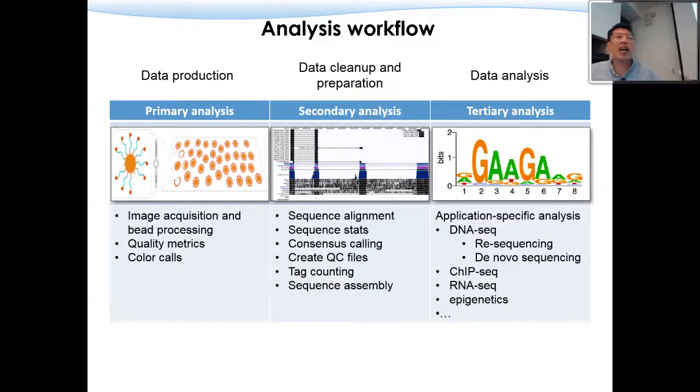Okay. If I got sequencing data, say this is RNA sequencing data from human, you can just readily do the analysis, which is doing the sequence alignment. You don't need to know if this is from cancer patients or this is drug treated or things like that. So this is called a secondary analysis. Normally, this is at the data processing level.